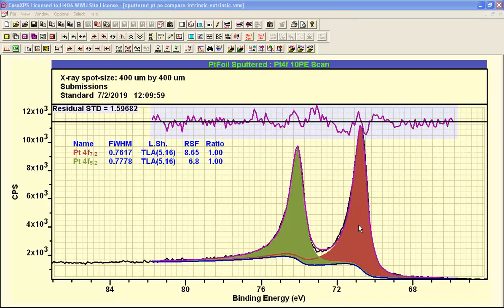we're left with what should be the photoemission signal that has undergone no scattering as a result of electrons moving through the sample. Then, in addition to the background signal, you also have the potential for loss processes to occur at the time of photoionization, but still these represent signal that arrive at the detector without undergoing scattering. So in some sense, all of these represent photoemission signal in a zero loss state. So we would like to model the shape of these peaks in order to work out the amount of signal we should attribute to each one of these peaks in particular.